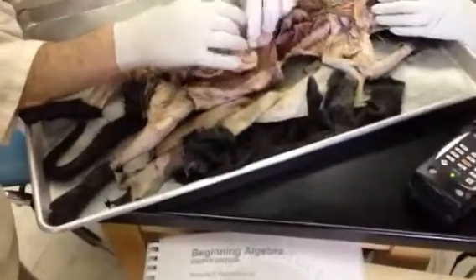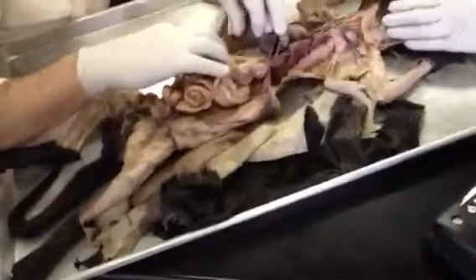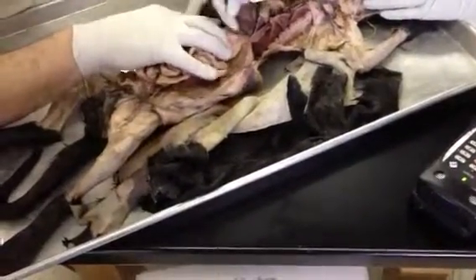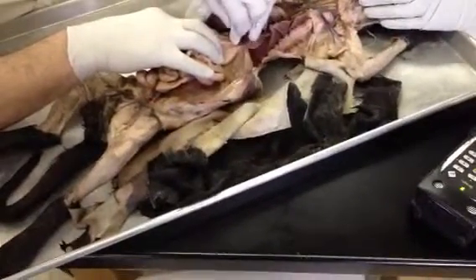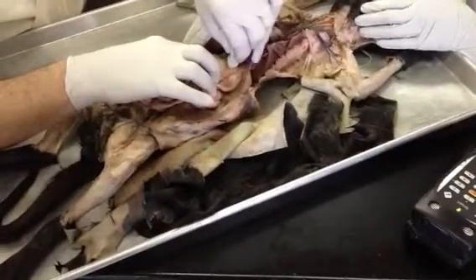The esophagus is underneath all this stuff. What I don't want to do is rip away. So it's the fundus. No, I can see the esophagus. The esophagus is right there, right? Index finger, that's the esophagus right there. Joining the stomach, that makes this part of the stomach right here the cardia.